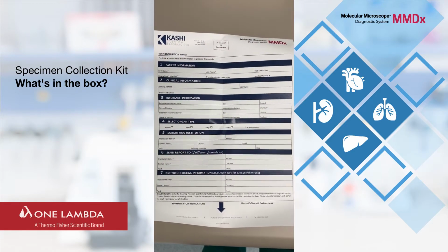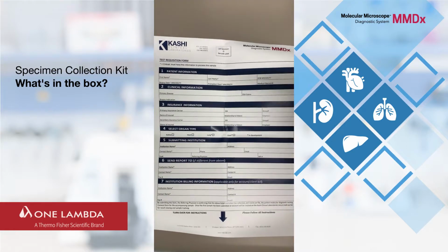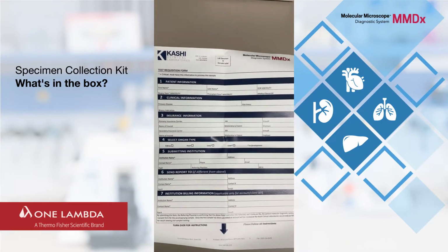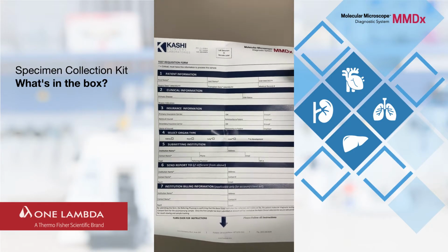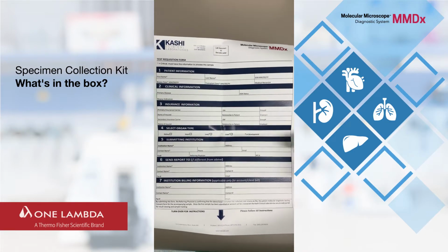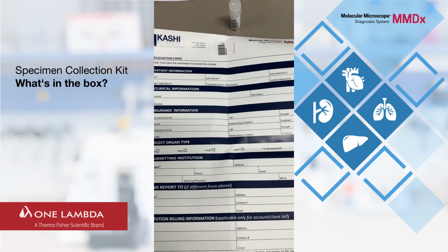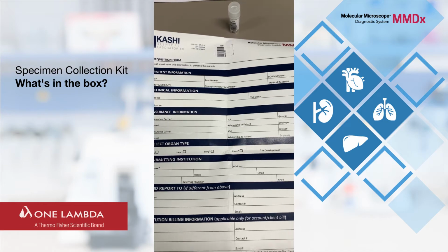Here is the specimen collection form, which is very straightforward. Please place the sticker of the barcode on the top of the form here and the other copy onto the specimen bottle. Please fill out the patient demographic information, the clinical information and the insurance and billing information and your institution details. You can see here that I've labelled both the form and the bottle with the corresponding barcode sticker.